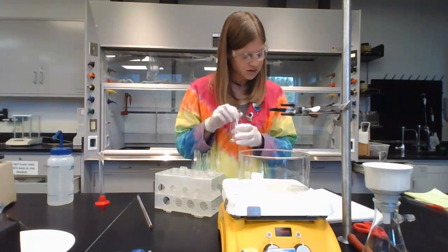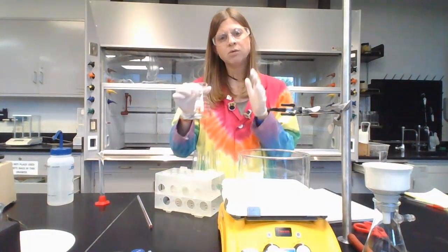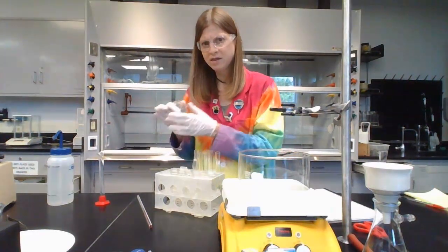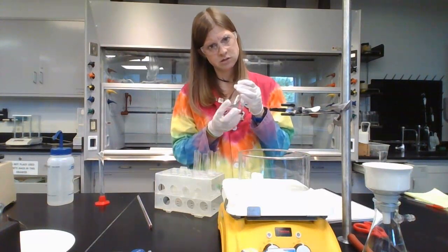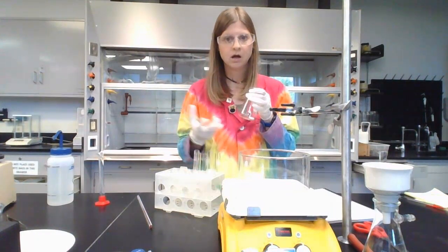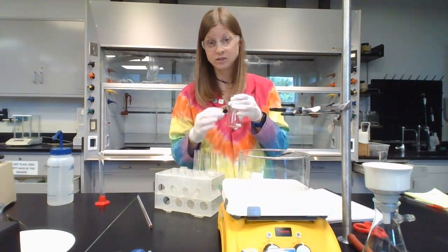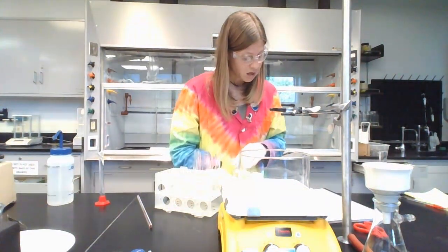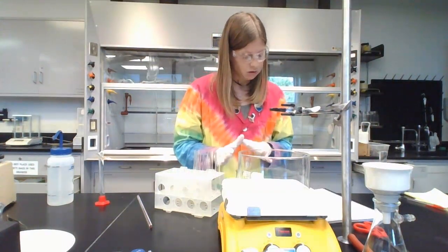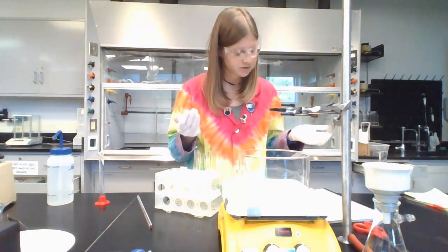So we're going to add the 40 milliliters of the deionized water and then swirl it. And then you're going to put it in the ice bath. So somewhere in this, 2 minutes in the ice bath, 40 milliliters of water, 10 minutes in the ice bath, hopefully you see white solid crystals starting to appear. And it's going to depend on how well things went on how many crystals there were. But at the end of those 10 minutes, hopefully you've got visible solid in there. Now, not all of it will be solid. There'll still be some liquid, but some visible solid. Okay. So we're cooling it down so that it doesn't dissolve in the solution anymore.